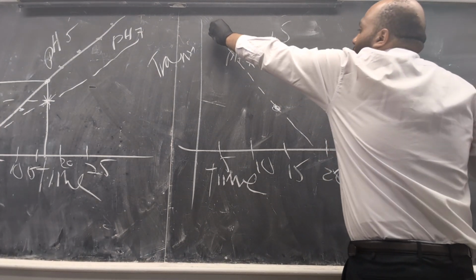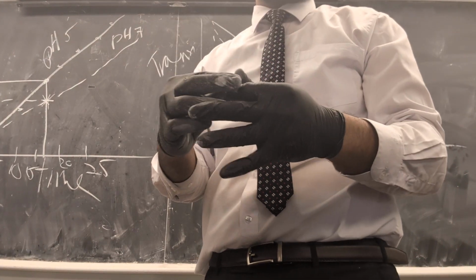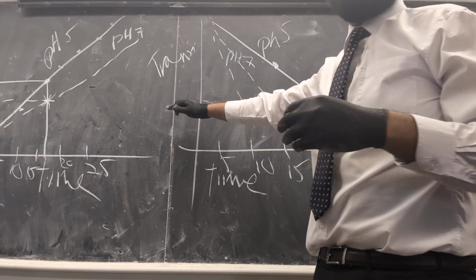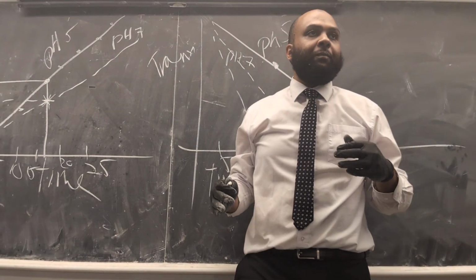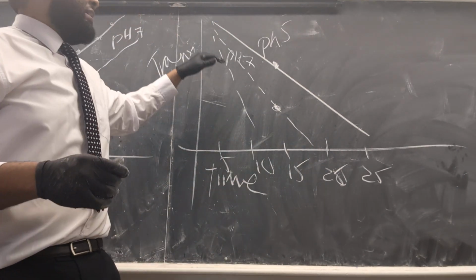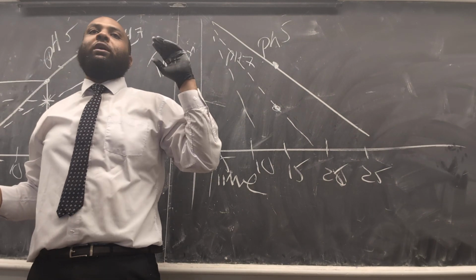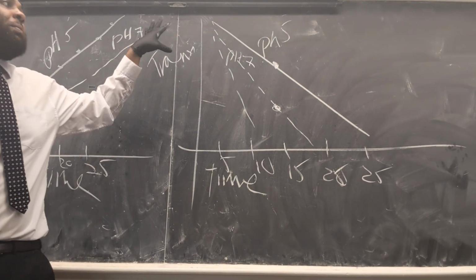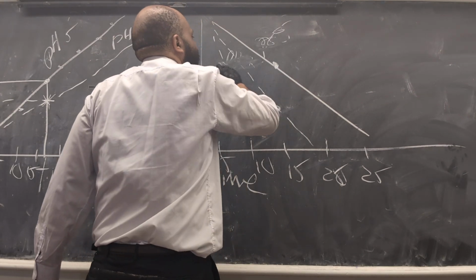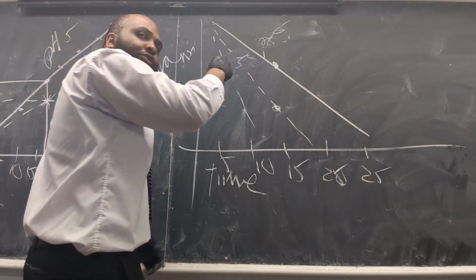And we have to do it for all the pHs. So that's the point. That's why we use the spectrophotometer, to get transmittance and absorbance readings and be able to make data that shows us the most optimal pH. And that is done for everything. For temperature, we're going to plot the same thing: at 25 degrees Celsius, at 30 degrees Celsius, at 40, and so on.